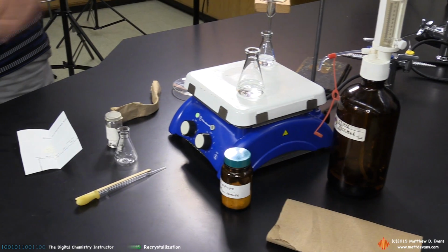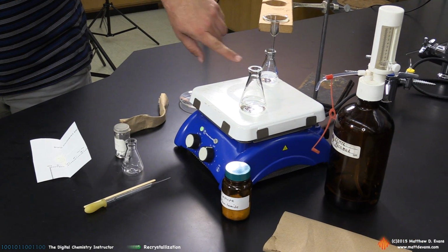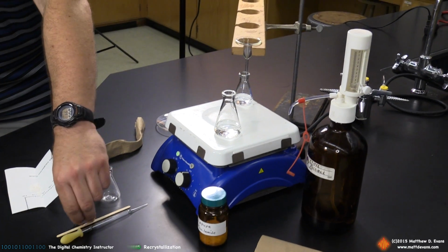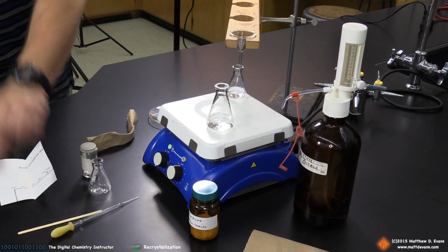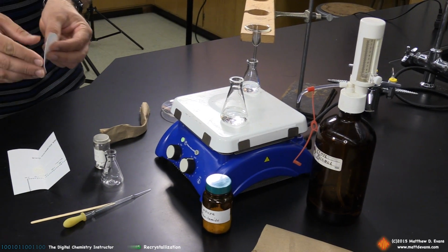And so the setup is a small flask, a little bit of solvent on the bottom. This is more than you need. A boiling stone's already in there. And actually a boiling stick would probably work better than a boiling stone, because a boiling stone is harder to get out. But last step is to fold filter paper.